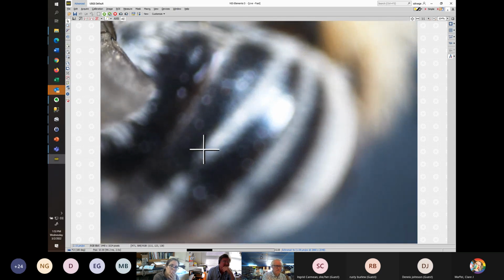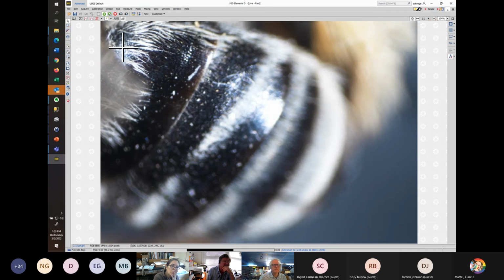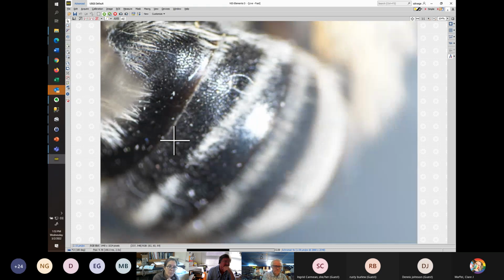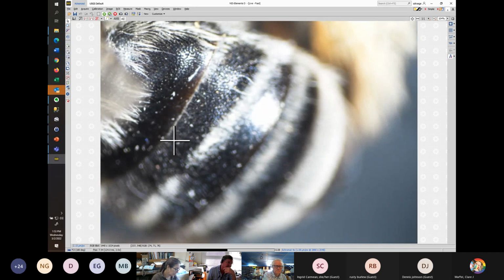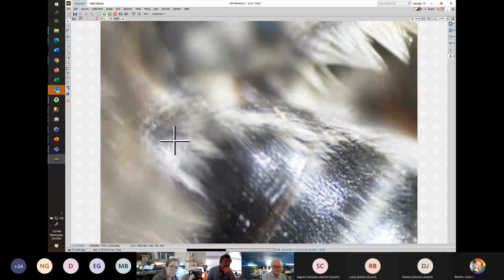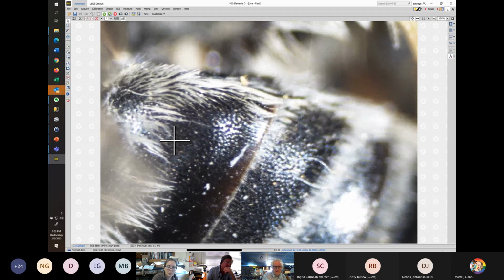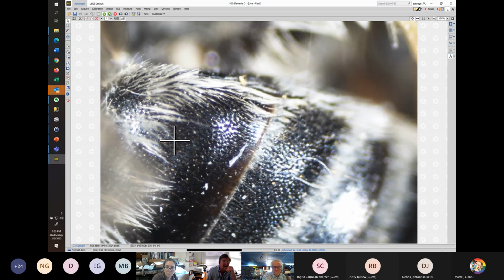We can zoom in a little bit more. There's a bunch of. Did you want the center, lateral, or what? No, I think that's enough.